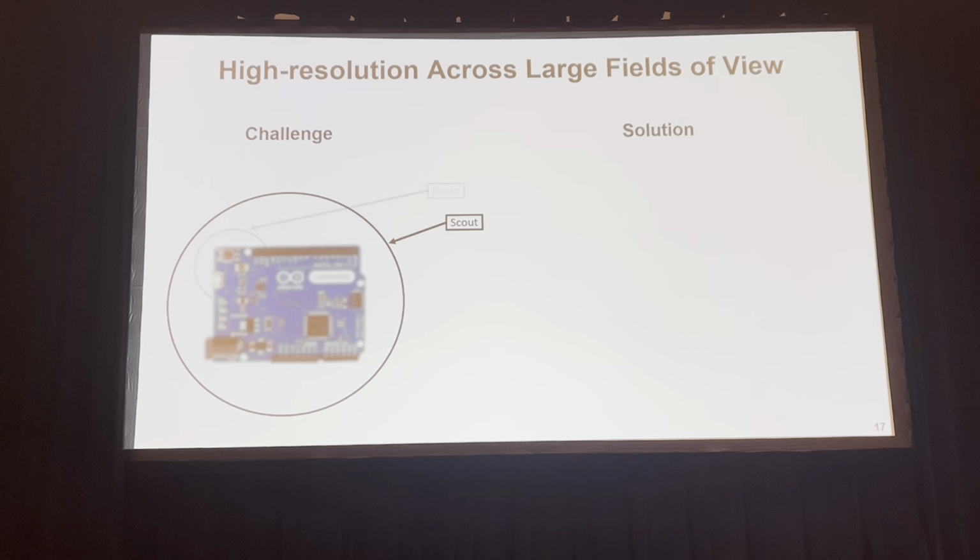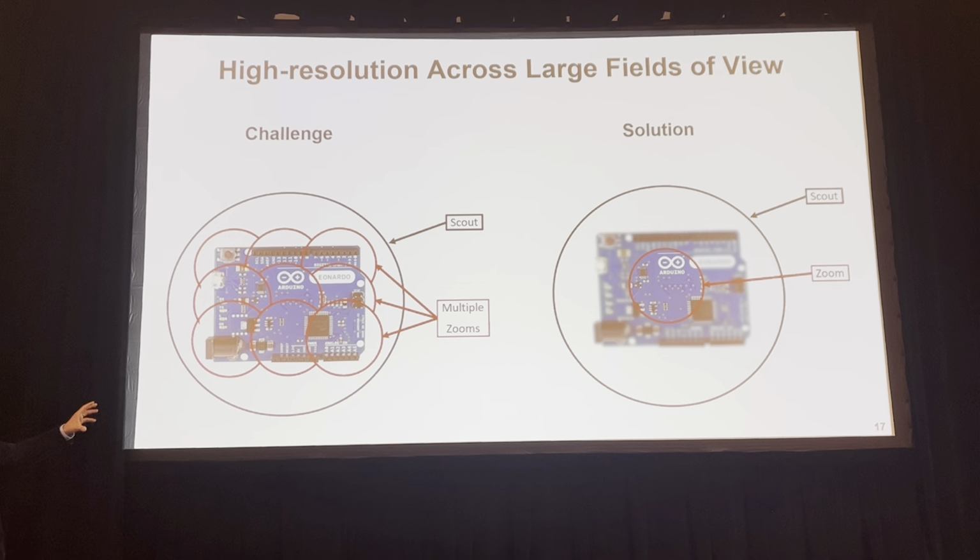Okay, now I'm going to go to a different modality. So that's how you can speed the reconstruction, but there is another challenge that is very classical when you try to scan flat samples or very large samples, and it's the compromise between the field of view and the resolution. The classical approach would be to start targeting a small field of view and collect a set of high resolution scans, but that will prove too long because you have to do this multiple times.